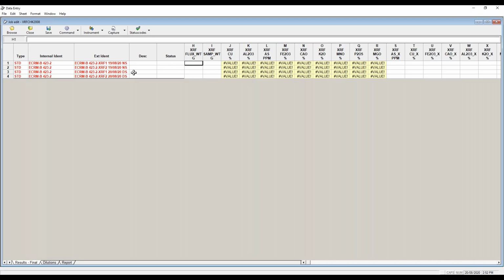Now, these aren't the true calibration that you might run on XRF, albeit irregularly for an X-ray, but if this was an ICP, you might do it every morning. These are a set of standards that are going to allow the lab to continue and not allow it to continue if they don't pass for the critical elements. So when we're setting up our standards for these calibrators, we'll only set tolerances in where they really matter, and if they fall out, we're not going to allow that instrument to be used.